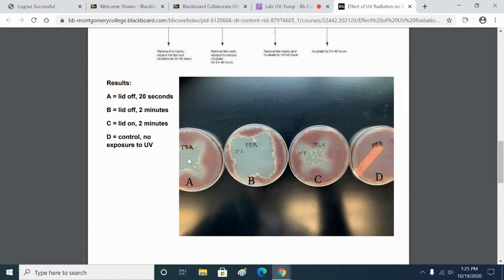So let me put it this way. Would you wear sunglasses made out of polystyrene? Because it could still go through. Right, so we can still see an X there, which means enough UV got through to kill most of the bacteria. So polystyrene blocks some UV, but not enough.